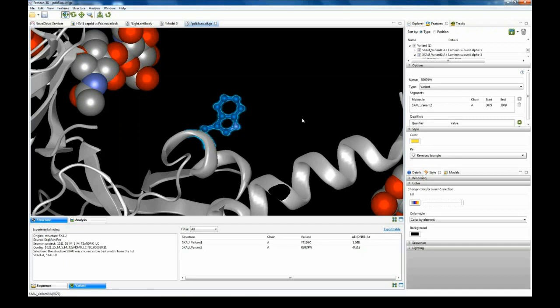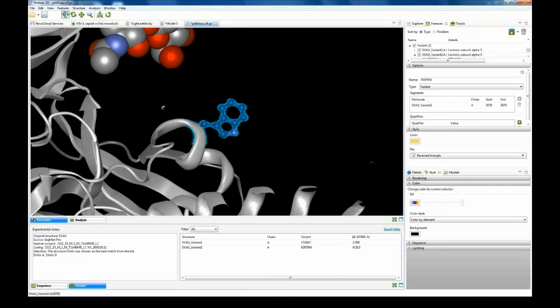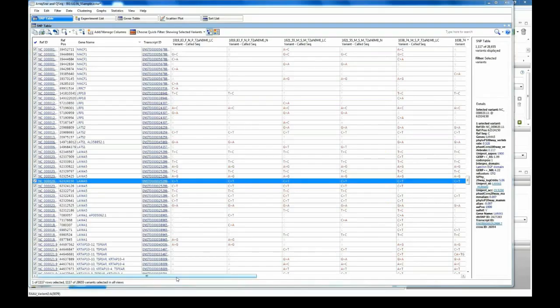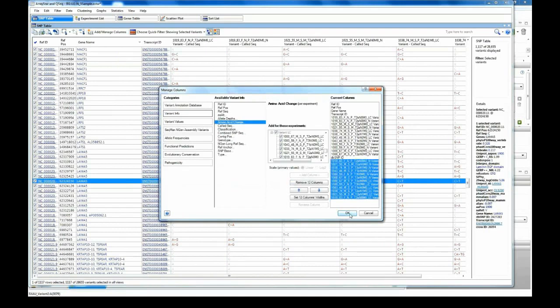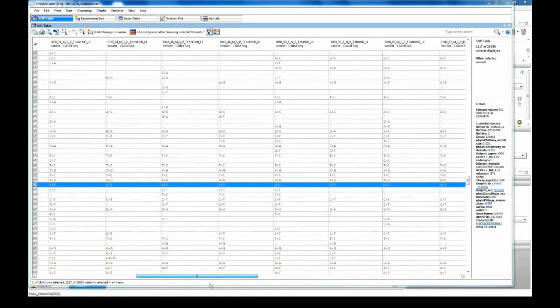Yeah, so I guess that's a quick overview of how we've integrated the NGS workflows and the structure prediction workflows. Obviously, these NGS workflows can be rather complicated, and that's one of my roles, where I can help people learn these tools if you're unfamiliar with them, and then learn how to use them with your structure prediction.